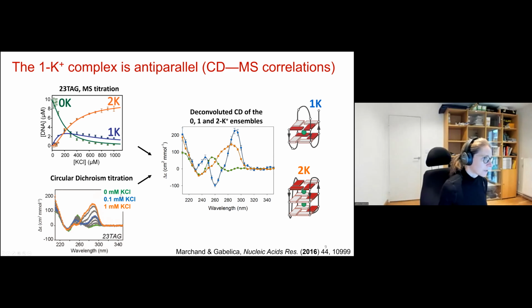So of course, the first state, the unfolded state, is easy to extract because it's the experiment you would do without KCl. The final state is close to the spectrum you will get with the maximum amount of KCl. But what would be difficult just from the CD spectrometry, where we kind of guess it's not just 2 states, is extracting the reconstructed CD spectrum of the intermediate species. And this is what we can do by knowing the amounts at each point in the titration.